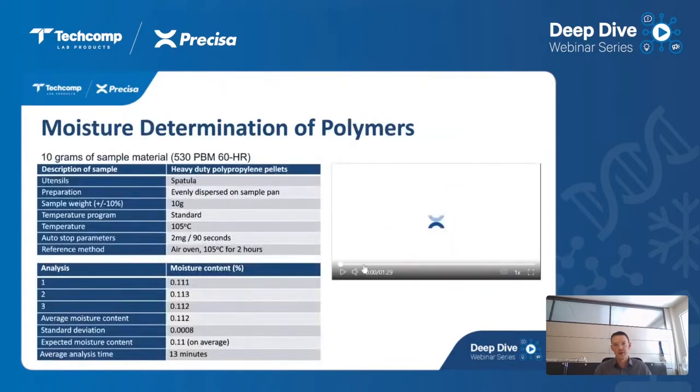Now let's have a look at how we tested this polymer. Here we have a video, which is also available on YouTube, where you can see how the moisture analyzer is being programmed and the analysis is being executed.